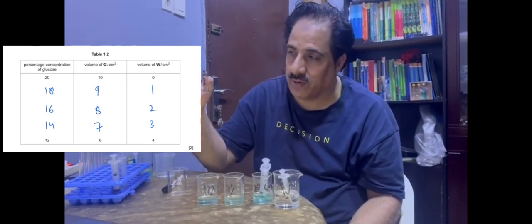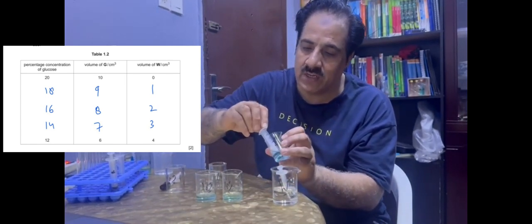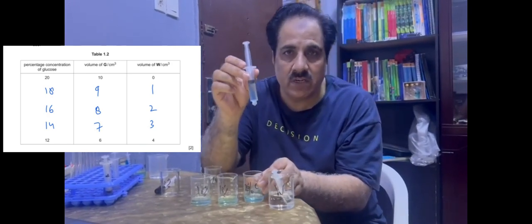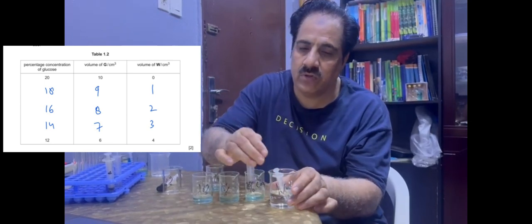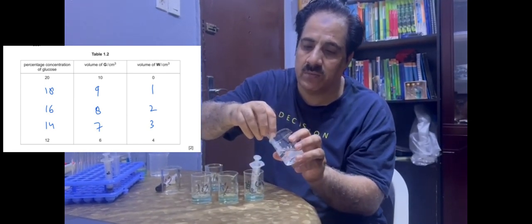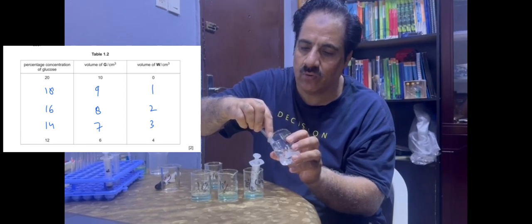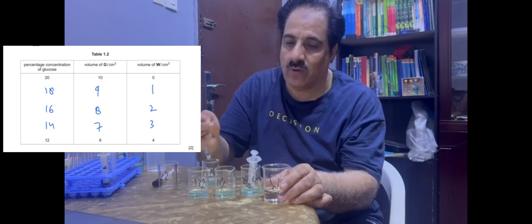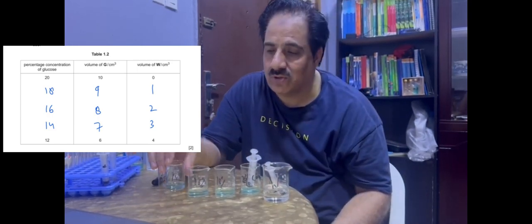Next is 14%. For the 14%, we will use 7 centimeter cube of the stock solution. This is 7 centimeter cube of stock solution. And to this, we will add the 3 centimeter cube of water. So this is 3 centimeter cube of water. So this one is the 10 centimeter cube of 14% solution.